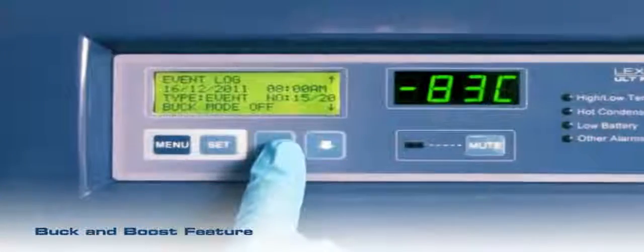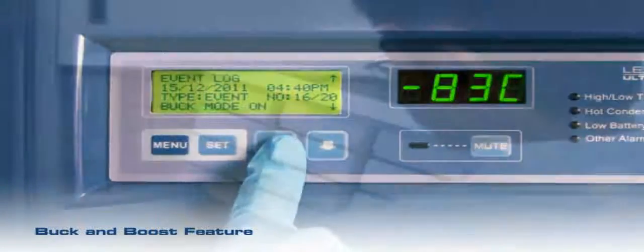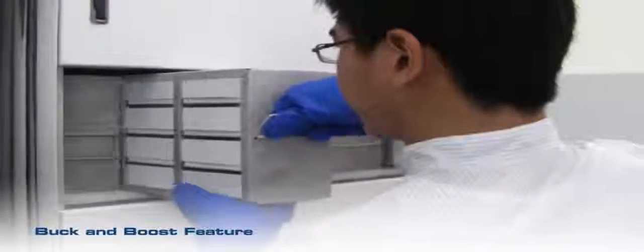Esco ERT freezer is equipped with buck and boost. This ensures both compressors are supplied with an acceptable operating voltage and thus improves the lifespan of the compressors.